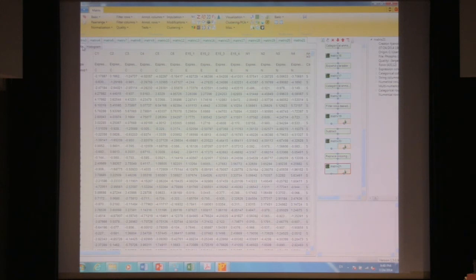If you think about what other options there are, Jürgen said we could use k-nearest neighbor, but you could also just fill it with a low value. That option is there in the imputation, replace missing values by constant, and you could choose a low value, but that's much more likely to give you spurious results in your statistical tests.